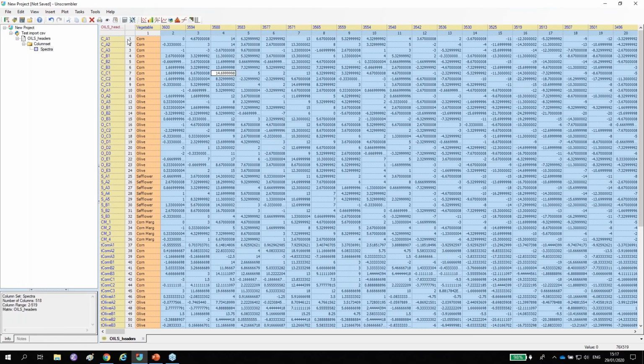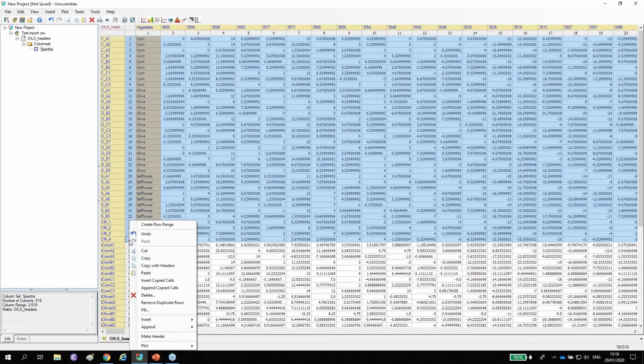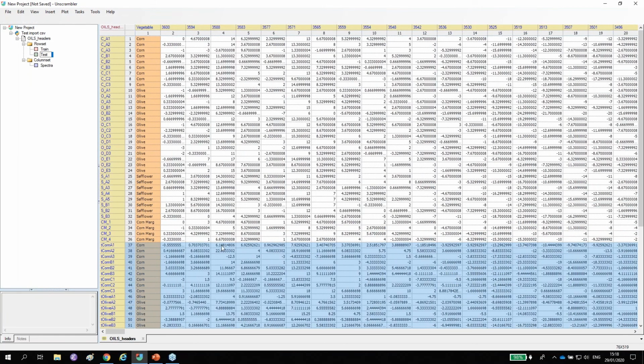I can define training and test sets, since that is always important, doing proper validation. Call these first few samples training, and the reciprocal collection I can call test. So reserve those for testing.